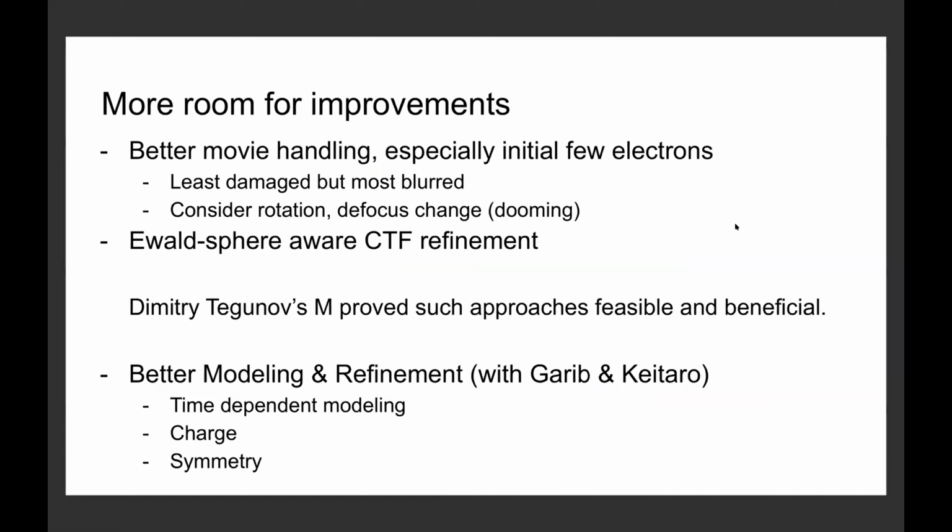And also currently CTF refinement does not take care of the Ewald sphere correction. So if we do Ewald sphere aware CTF refinement, we can get better defocus parameters and better resolution. Dimitry Tegunov's M proves such an approach is feasible and beneficial, so it is probably worth implementing similar algorithms in RELION.